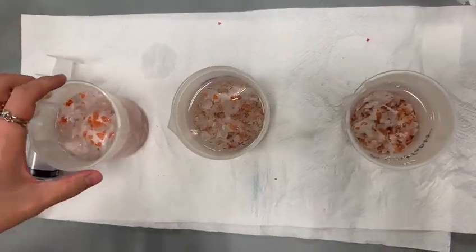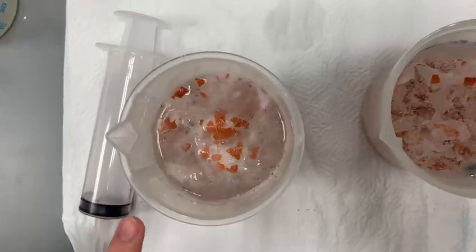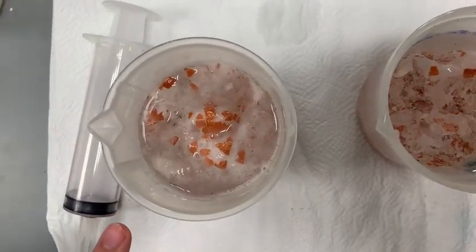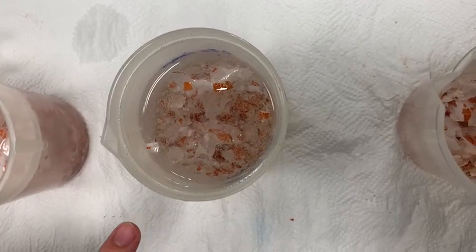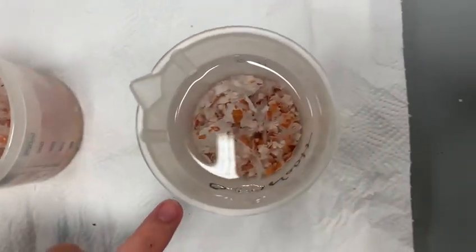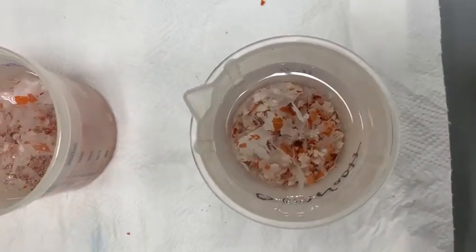Over here, we can see that this one is for the 1-time concentration of vinegar. This one is for the 0.5-time concentration of vinegar. And this is the control setup, which is just the water.